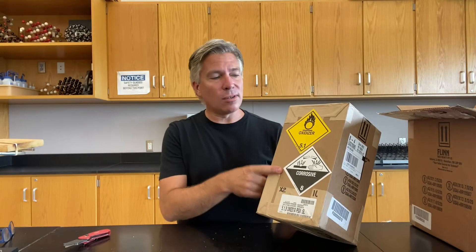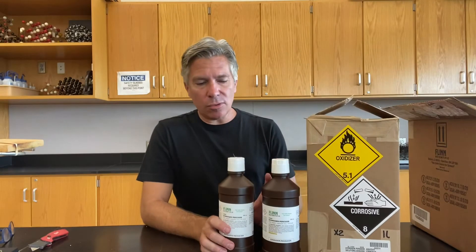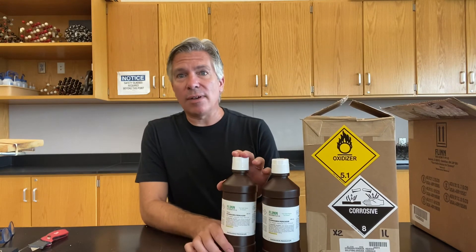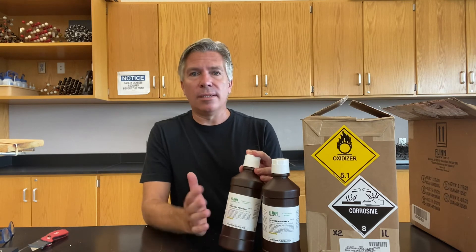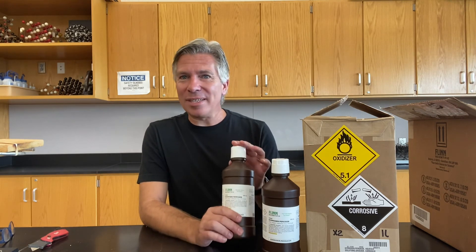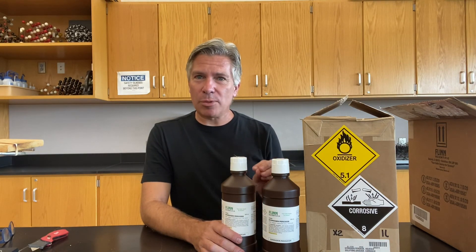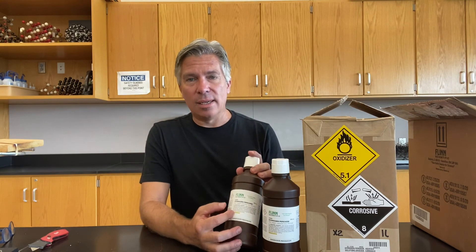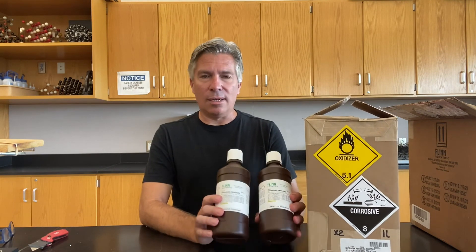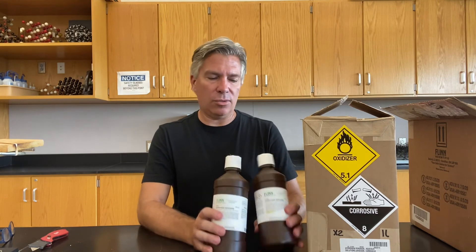It's getting real when it says oxidizer and corrosive on the same box. These two were bottles of hydrogen peroxide. The stuff you buy at the drugstore is usually about 3% hydrogen peroxide and 97% water. This is 10 times that — 30% — so it comes in its own special packaging. You want to be careful with this, and it comes in brown bottles so that light doesn't get to it.